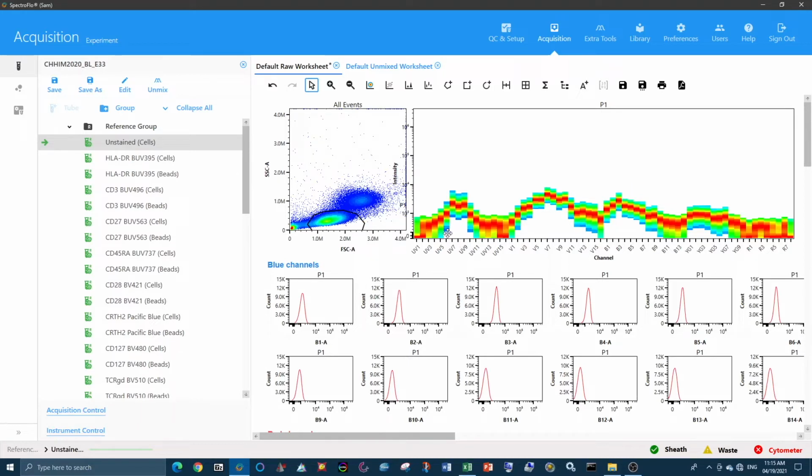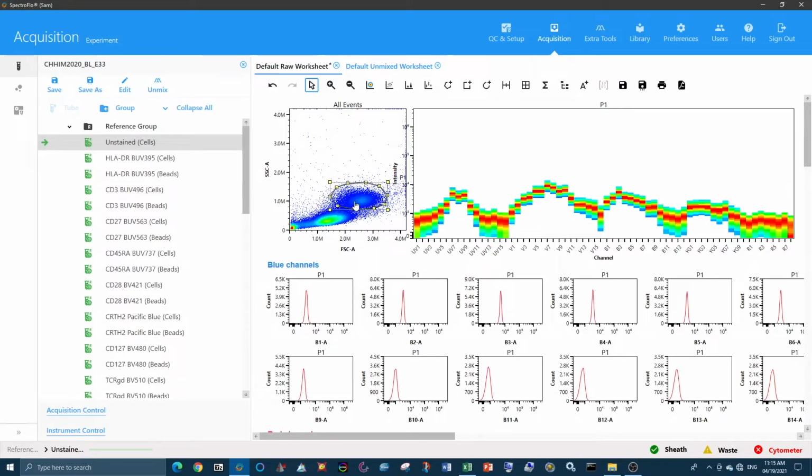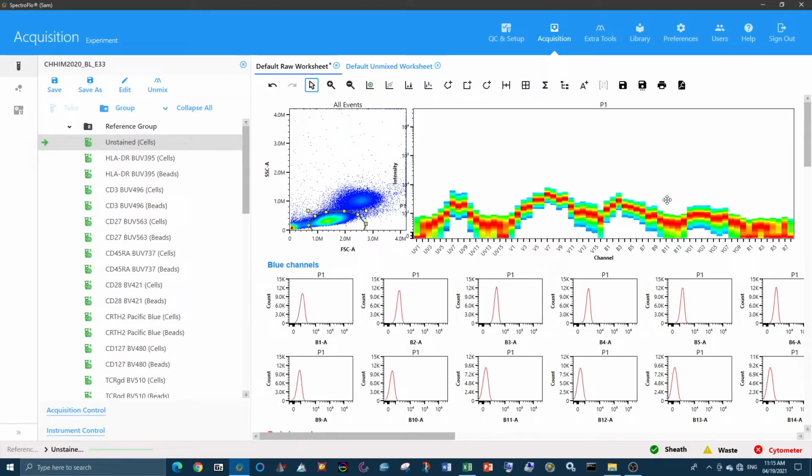You can see that I do have some decent fluorescence in the UV, the violet and the blue, and a mild amount in the yellow-green. This is not contaminating fluorescence, this is just autofluorescence. What I'm actually looking for is very distinct signatures of known dyes. I can check the other cells in the sample to make sure that they aren't contaminated either, but everything looks clean. I'm just seeing autofluorescence, so my unstained is in fact unstained.